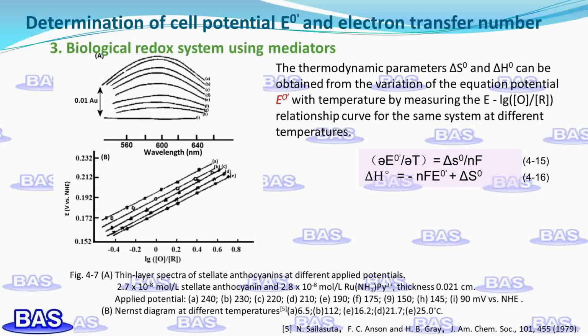For example, in the absence of a mediator, it takes several hours to electrolyze cytochrome c in an optically transparent thin layer cell, but only a few minutes with a suitable mediator. The basic requirements for selecting a mediator are: the mediator must quickly and reversibly exchange heterogeneous electrons with the electrode and transfer homogeneous electrons with biomolecules. It must be stable in both the oxidized and reduced states. Its spectrum must not overlap with the spectrum of biological components.